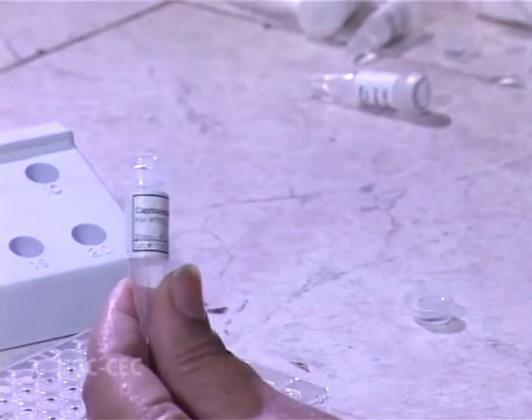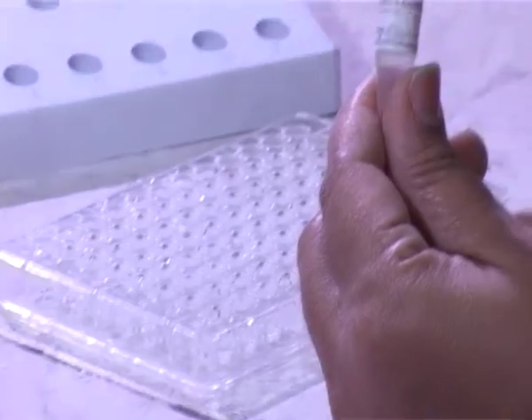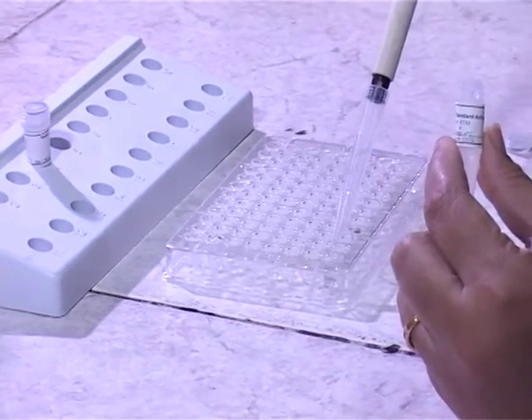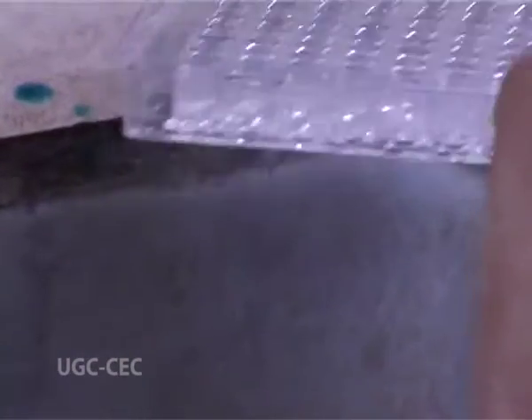First, we have to coat the microtiter wells with one antibody. This antibody is called capture antibody and it is not labeled. Next, after washing the wells properly, we will add the antigen. If the specific antigens are present in the sample, they will bind to the antibody. Then again we have to wash the wells properly to remove all the unbound antigens.